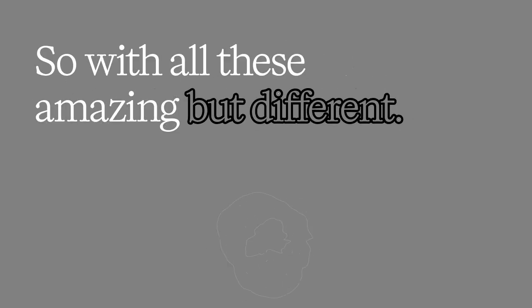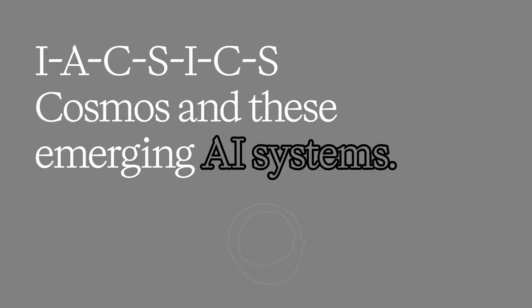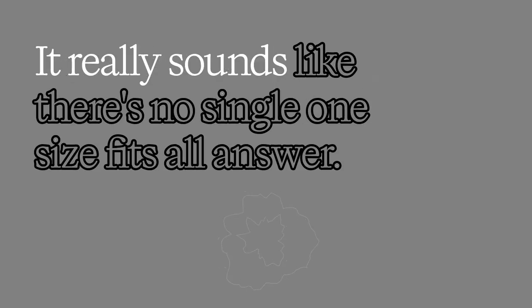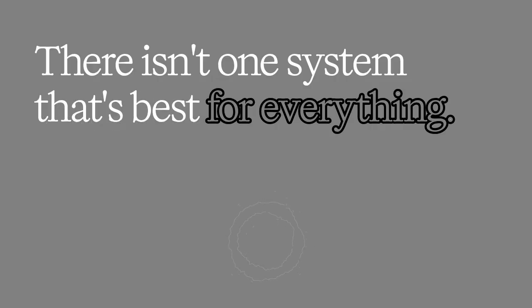So with all these amazing but different options, IACS, ICS, Cosmos, and these emerging AI systems, how do researchers actually choose the right IACS system for their specific needs? It really sounds like there's no single one-size-fits-all answer. That's absolutely correct. There isn't one system that's best for everything.